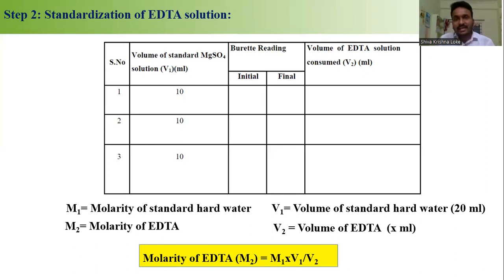In this second step, we have to perform three titrations. The 3 titrant values should be successive. We have to titrate 3 times, right? So we have to get 3 successive values, like the same values. After getting those 3 values, we'll calculate M1V1 equals M2V2.